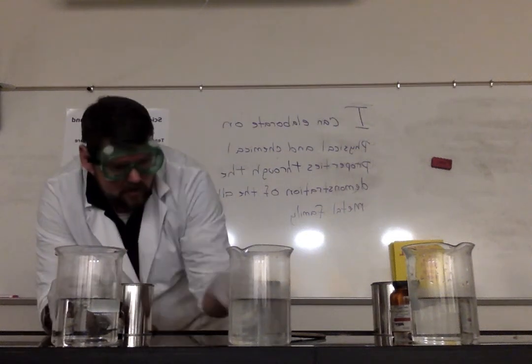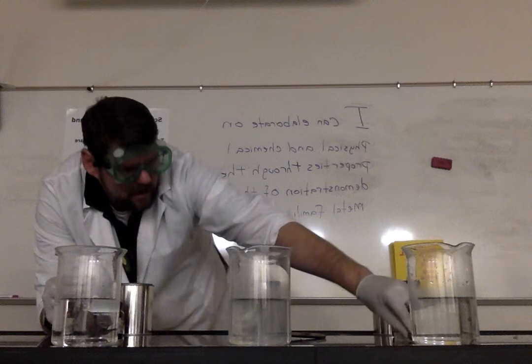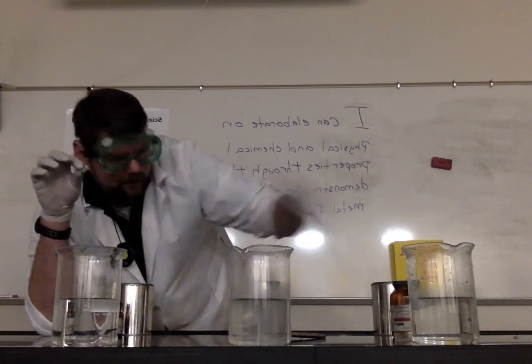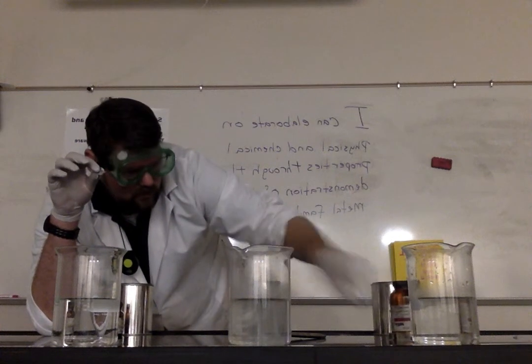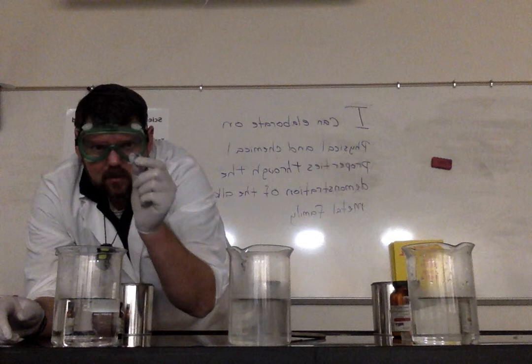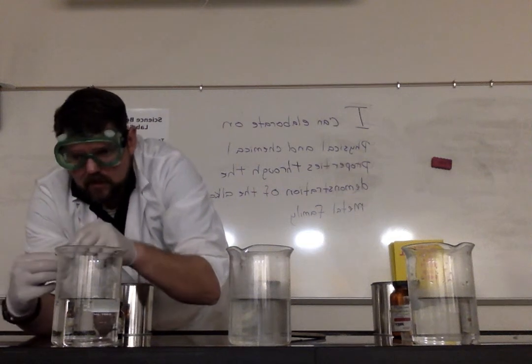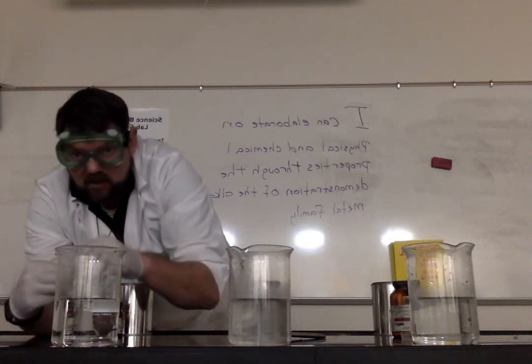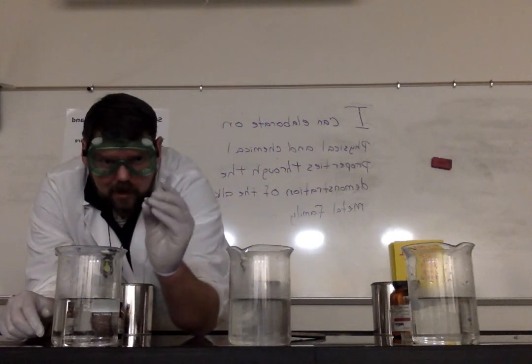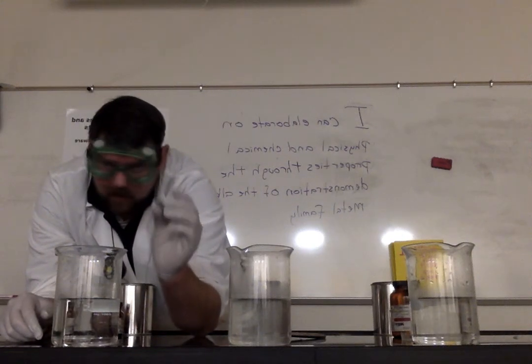Now we've noticed these others, they had a lot of tarnish. This one doesn't tarnish as much. Okay, so we see a lot more silver color. So I don't even have to cut into it. I'm not even going to use a knife. This is almost like pulling apart bubble gum. So really kind of cool. Okay, this is potassium.